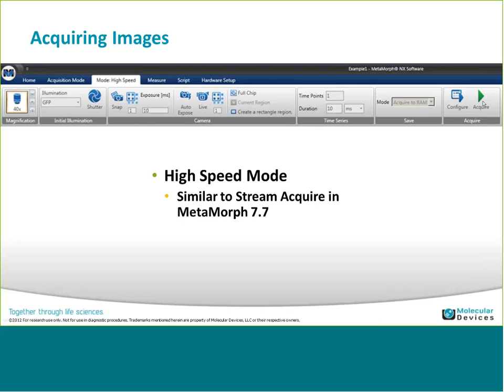So the targets allow you to set the areas you want to project the laser onto. The duration is the length of time that the pulse is going to be exposed. And then you set up your activity as far as the acquisition sequence. The interval is how often you want to acquire, the number of time points, so calculate the duration from that.